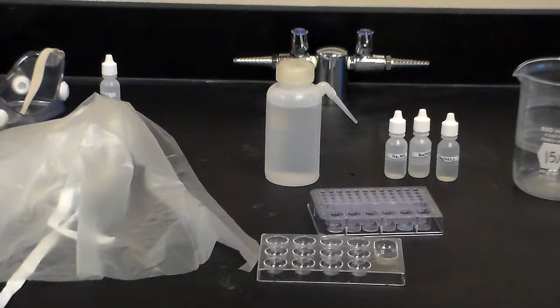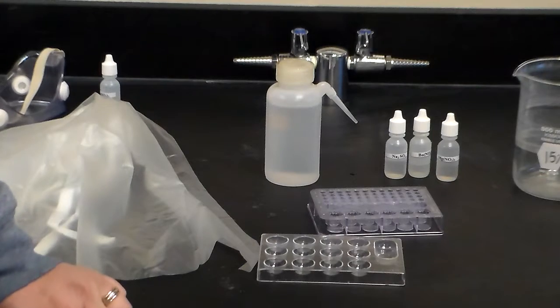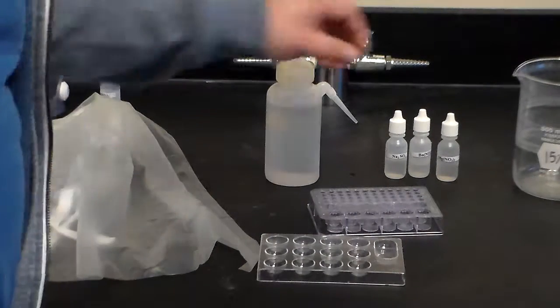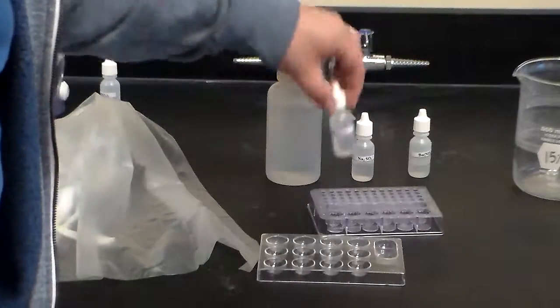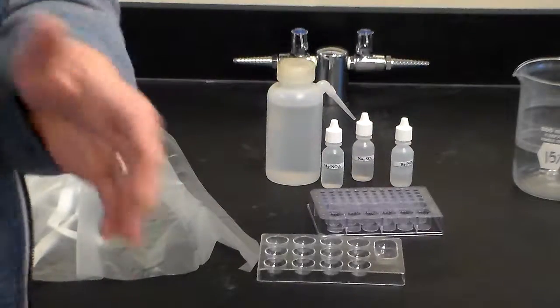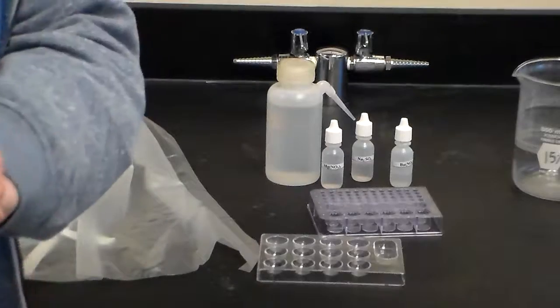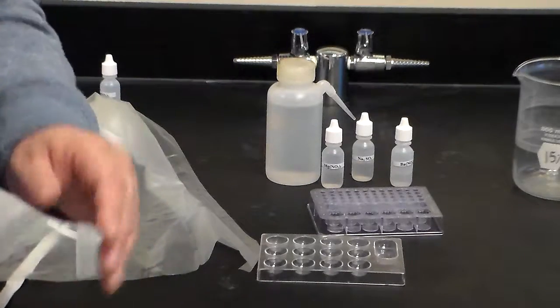Hello and welcome. This would be the instruction for the Precipitate Lab. So, the background behind this, we have binary ionic compounds like sodium sulfate, magnesium nitrate, barium nitrate. Now there is a cation and an anion. Pay attention. Cation is your positive, anion is your negative.